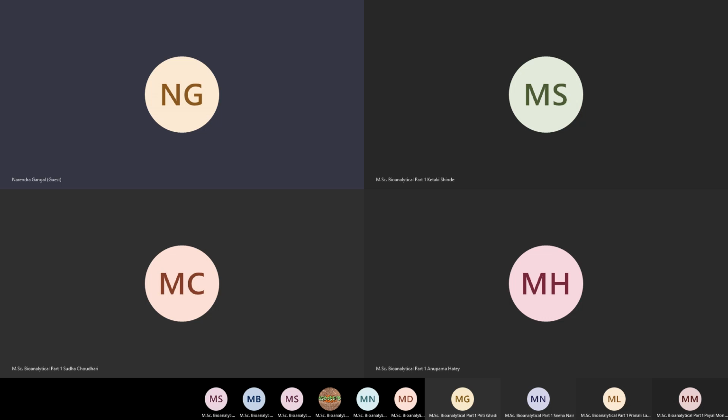Based on various requirements, we studied last time, one was EI, which uses high energy electrons, 70 electron volts being the energy which bombards. Why EI and why 70 electron volts? We studied that 70 electron volts is an optimized energy. Scientists studied from lower to higher energies, and found that the maximum amount of information is generated when electrons have 70 electron volts.